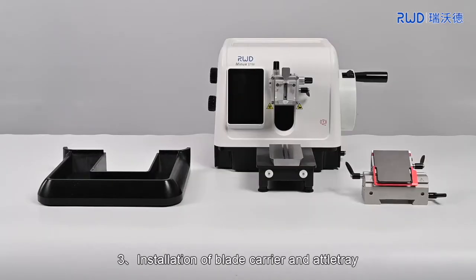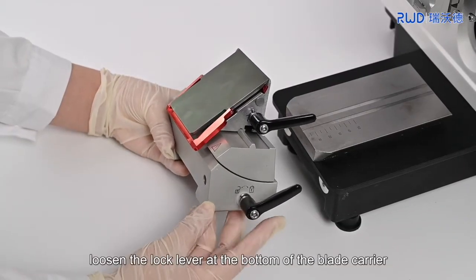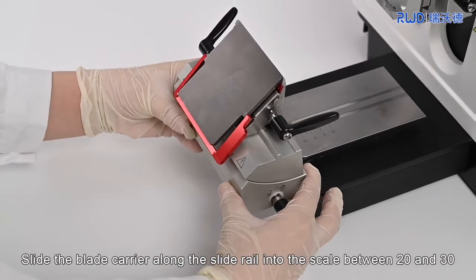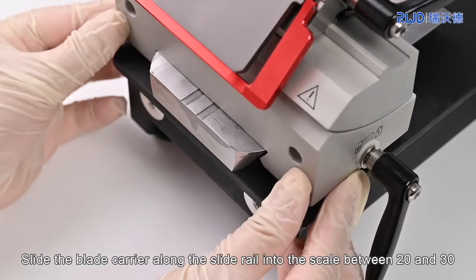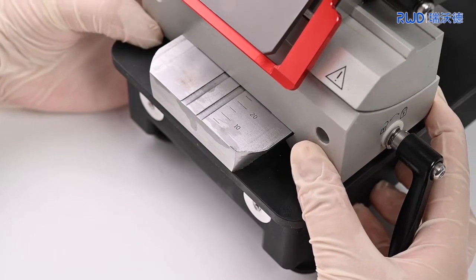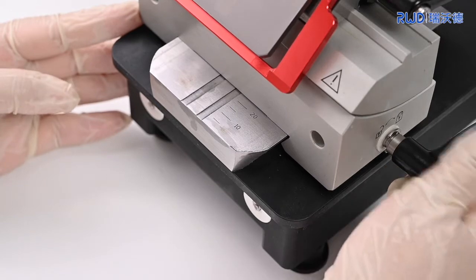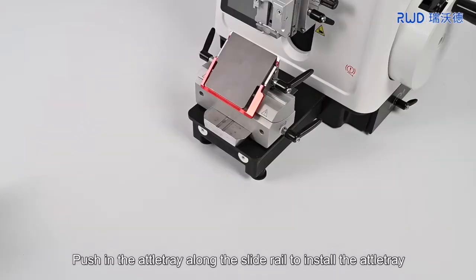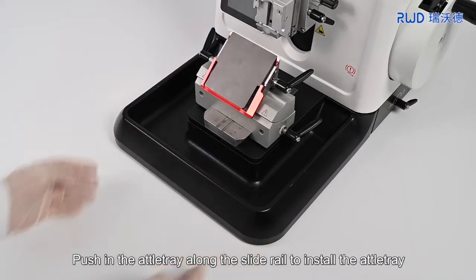3. Installation of blade carrier and Addle tray. To install the blade carrier, loosen the lock lever at the bottom of the blade carrier. Slide the blade carrier along the slide rail into the scale between 20 and 30. Tighten the lock lever to fix the blade carrier. Then push in the Addle tray along the slide rail to install the Addle tray.